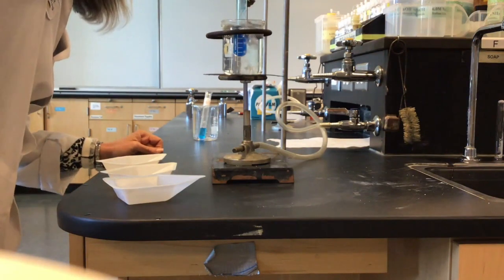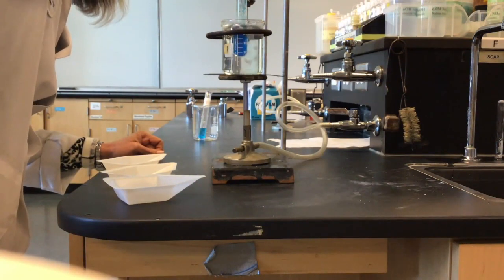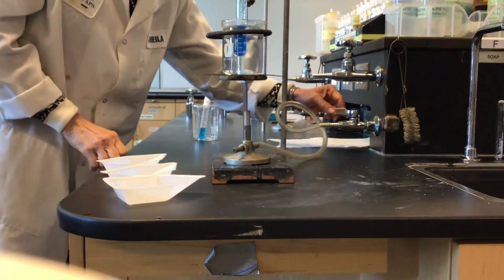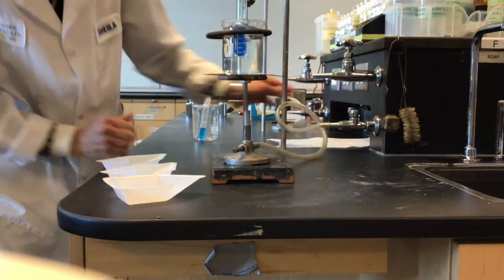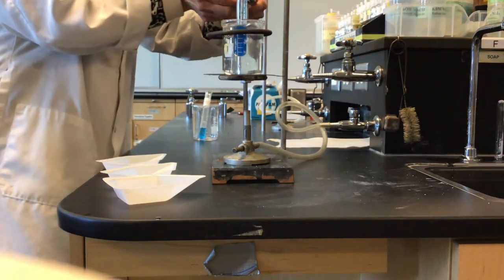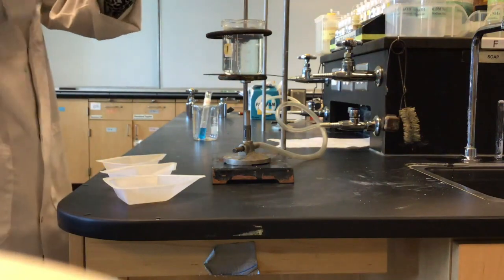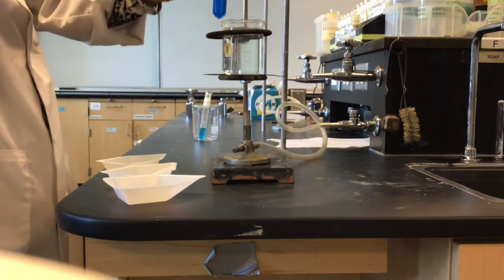I see solid stuck at the bottom. Let's make sure we get everything off the side. And our sample is no longer dissolving. We have finally reached the solubility point. We have a very saturated solution here with copper sulfate pentahydrate, and there is solid on the bottom here. If I can take it out, you might be able to see that there is a little bit down here that did not want to dissolve.